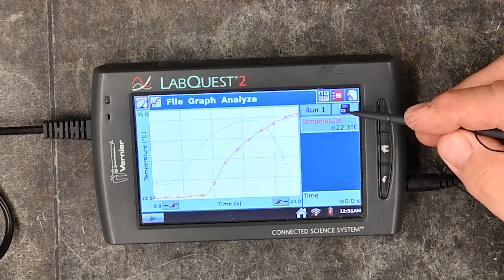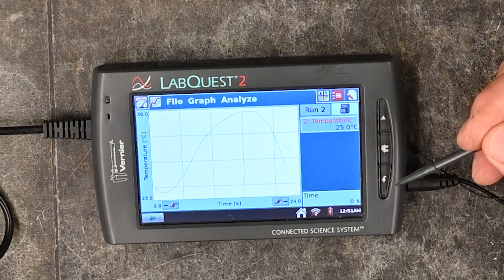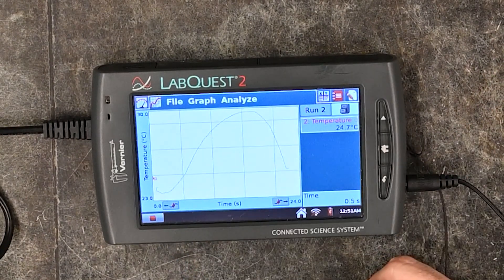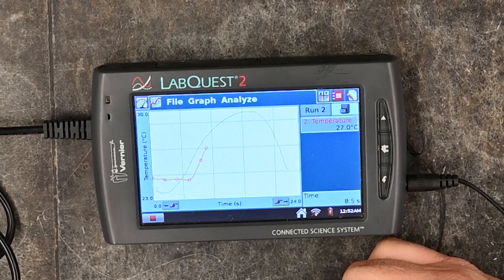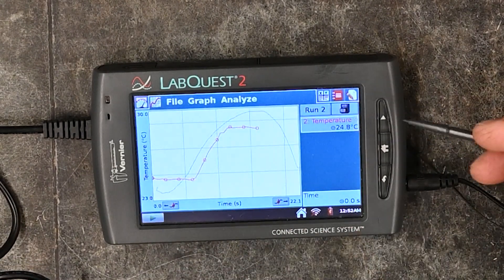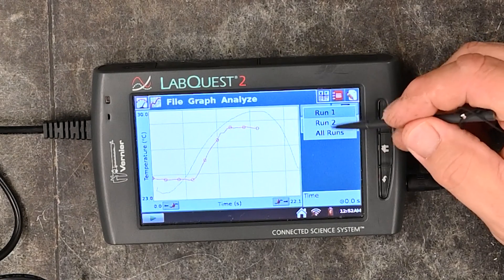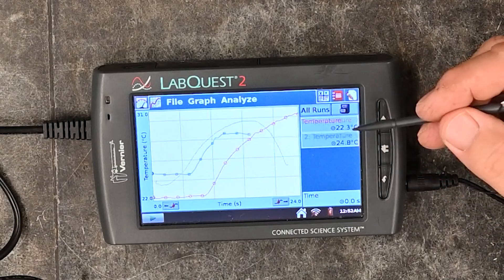Over here next to run 1 there's a little file cabinet icon. If you click on that it stores run 1. If you click the play button again to start collecting, you'll get run 2. You can then click on run 2 or go back and look at run 1, or view all the runs together.